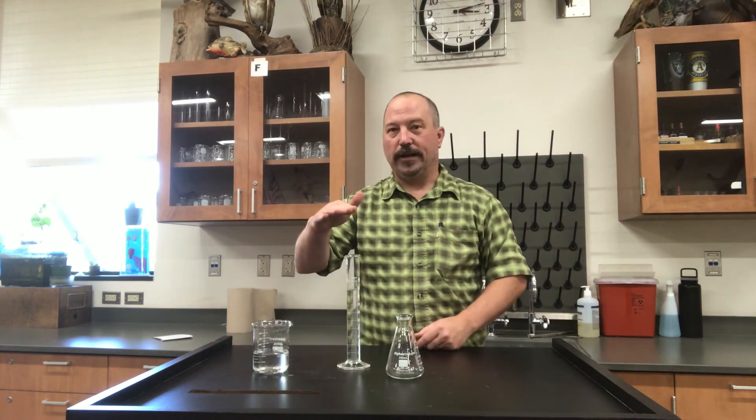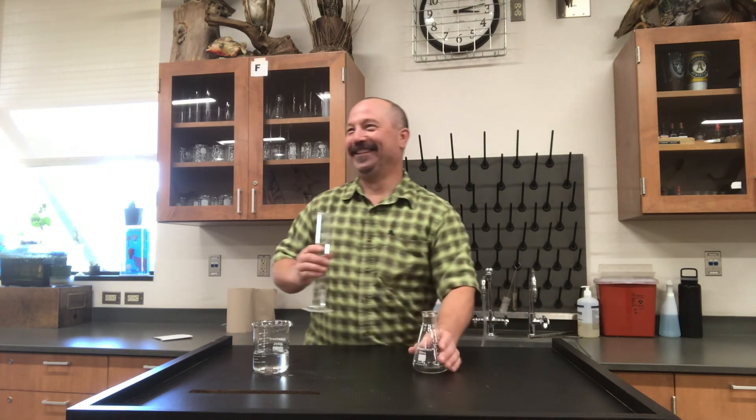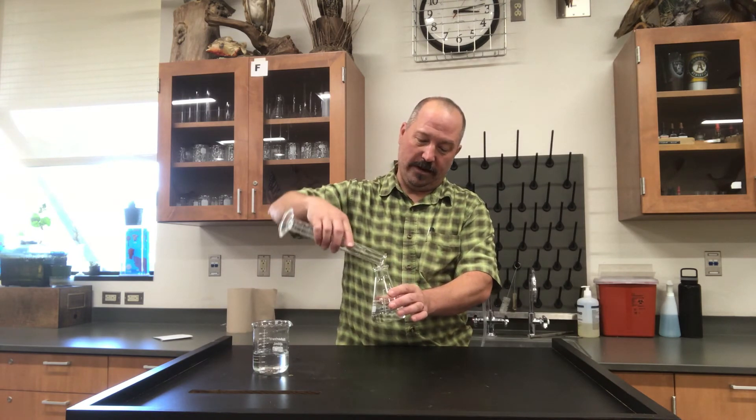So, beaker, graduated cylinder. This right here is called an Erlenmeyer flask, named after a guy named Flask. You would transfer your liquid into the Erlenmeyer flask.